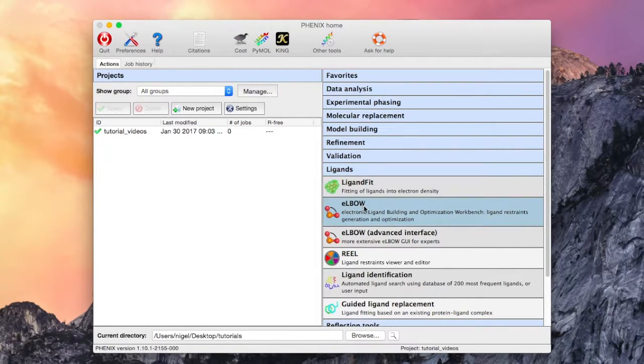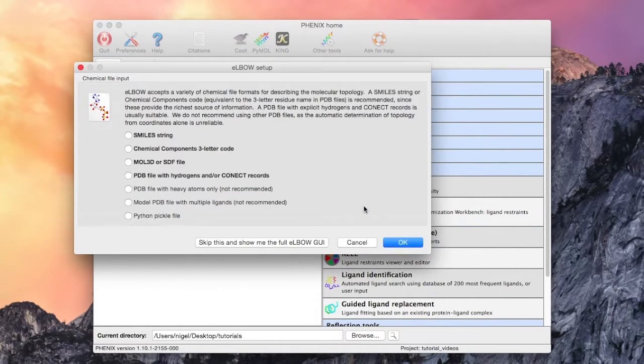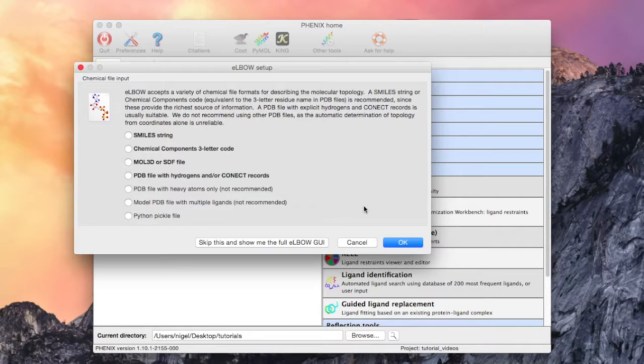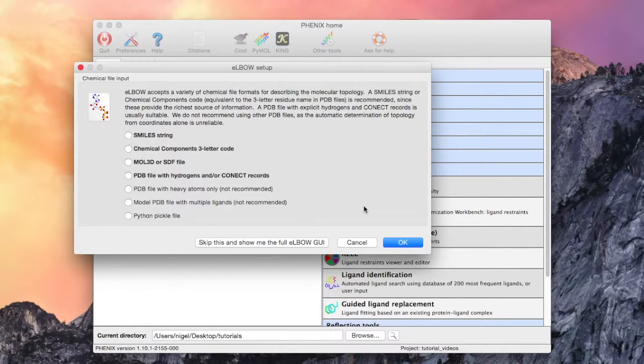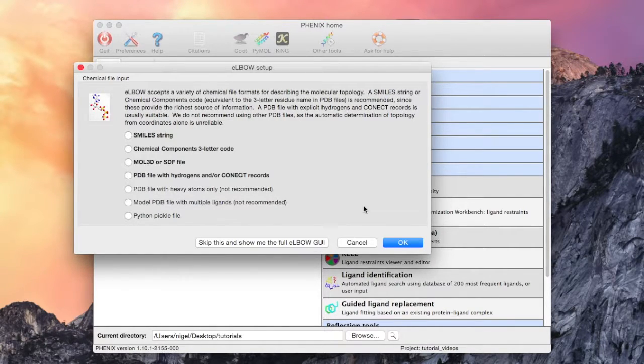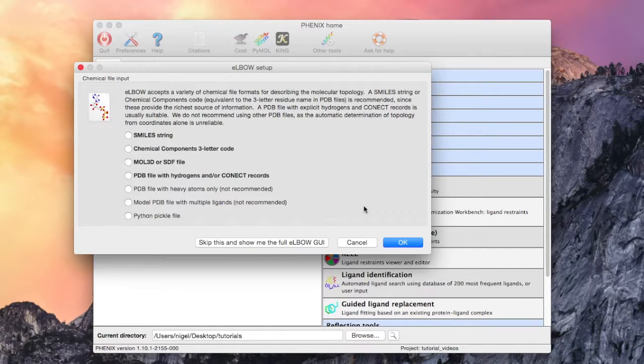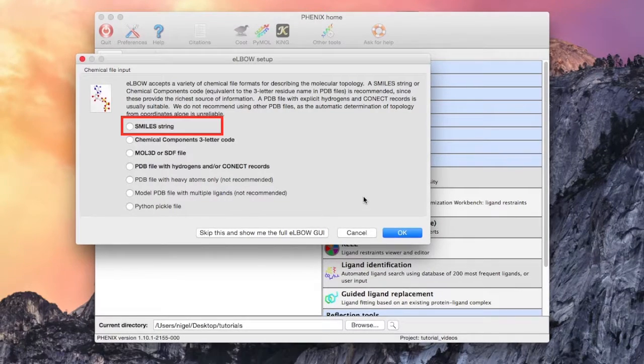Upon choosing the simple elbow GUI, the first panel displays some choices for molecular input of the ligand. Some are preferred because these formats generally provide unambiguous descriptions of the molecule topology.